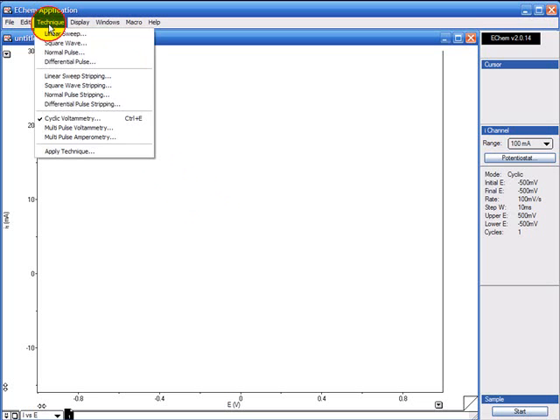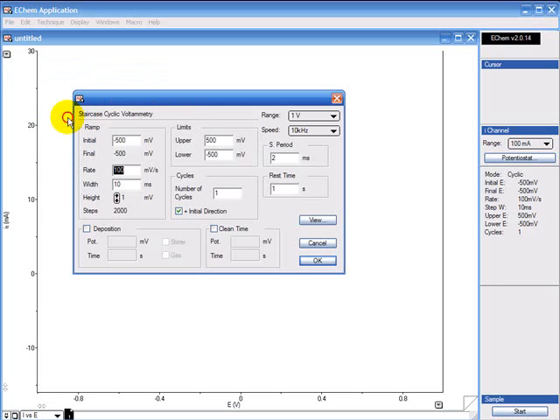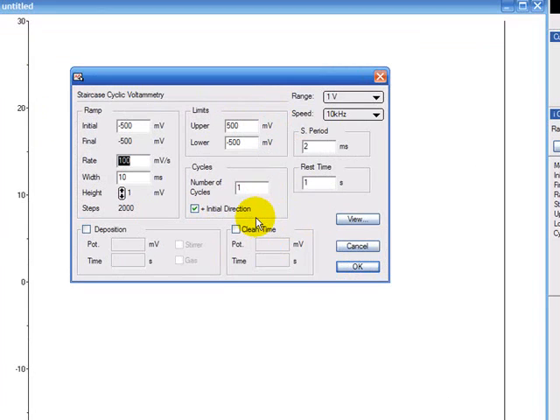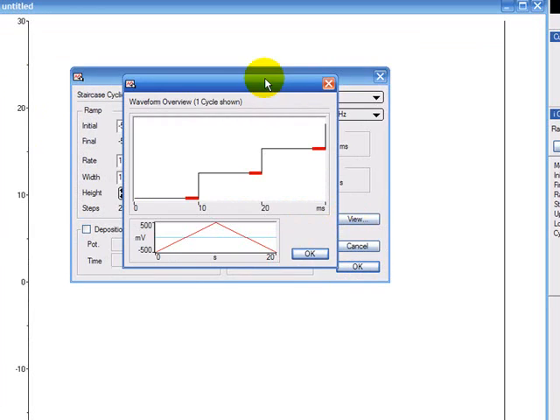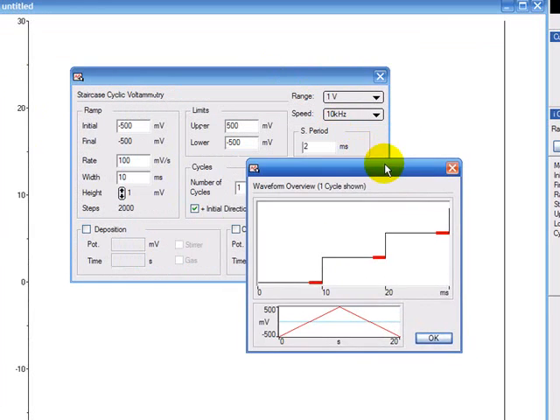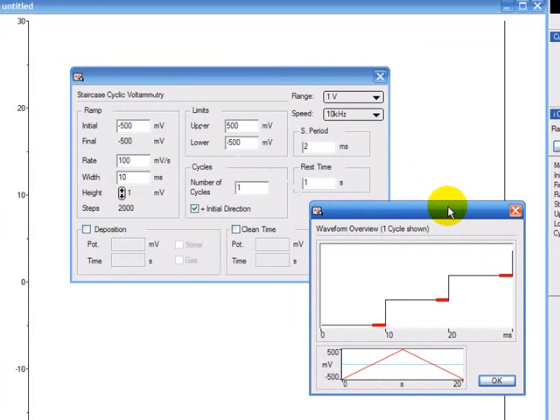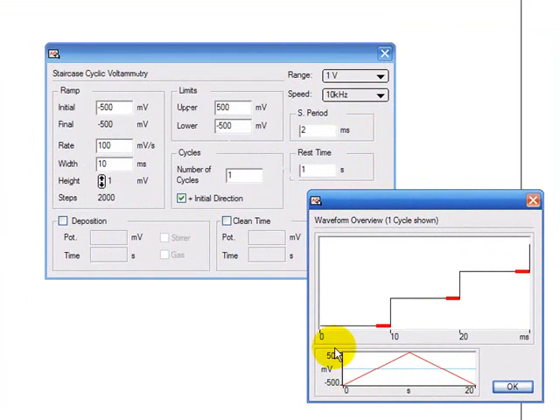In the menu technique you click cyclic voltammetry and this is where you enter the parameters for your experiment. A good way of viewing what's going to happen is to click on view. This shows a diagram showing the experiment.